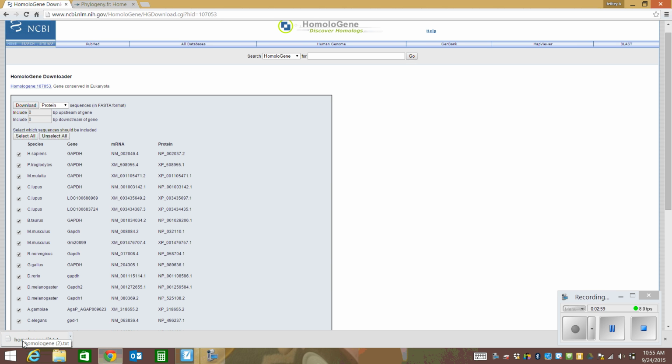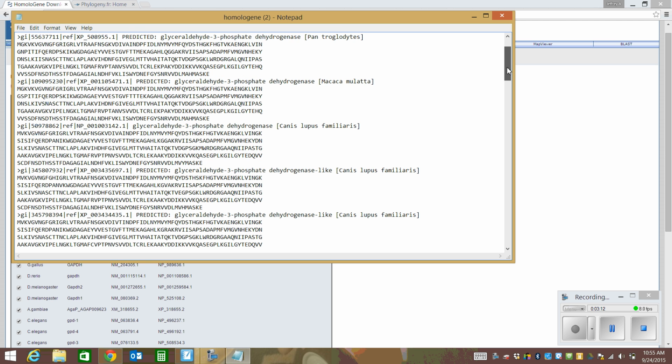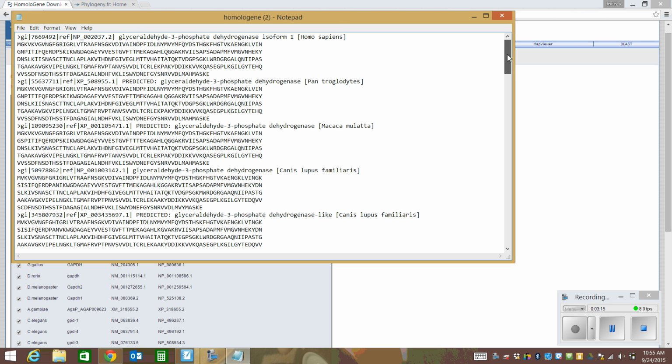It's going to show up a little bit different on your Chromebook. Regardless, it's going to be a text file, which is a very basic file format for computers. It's usually read by a lot of different types of programs, whether it's an Adobe program or a Microsoft program. So this Notepad file is going to be the one that we're going to use. Now you have two options. One, you can save this and then load it into your next website, or you can copy this, paste this onto a document, and then just copy and paste it later.